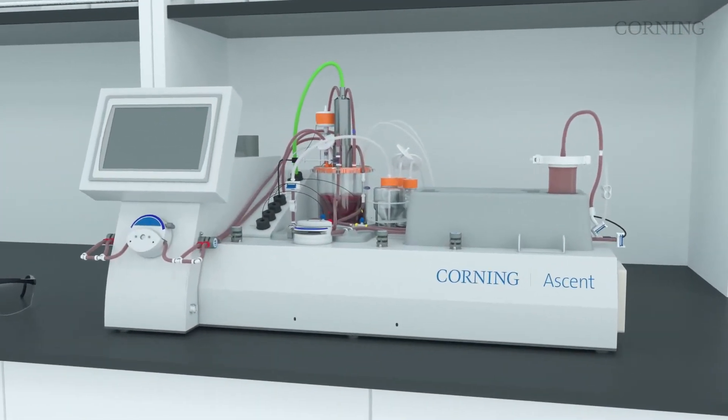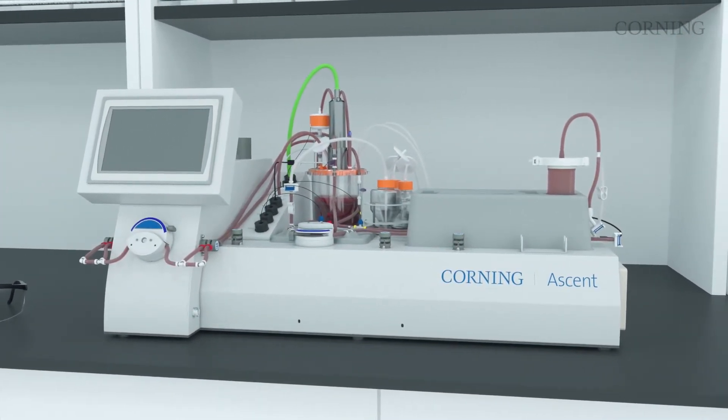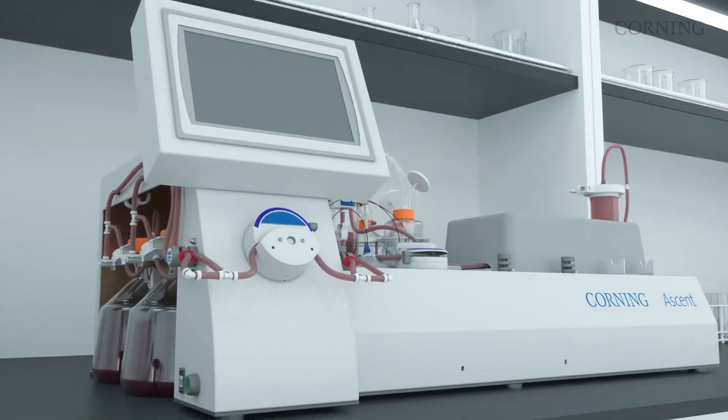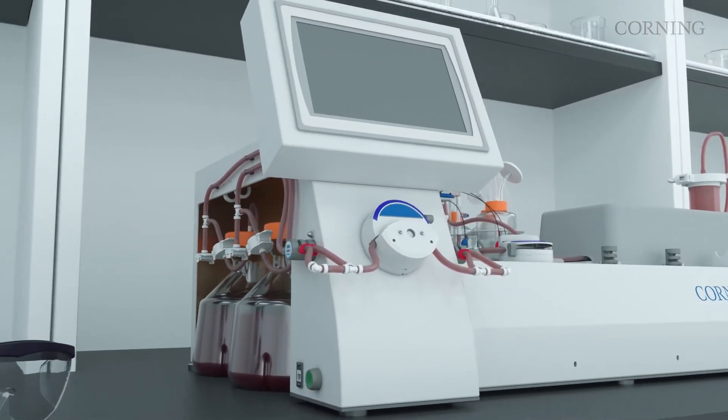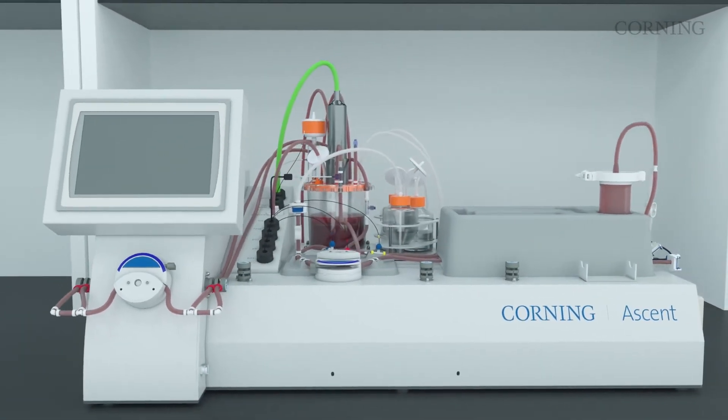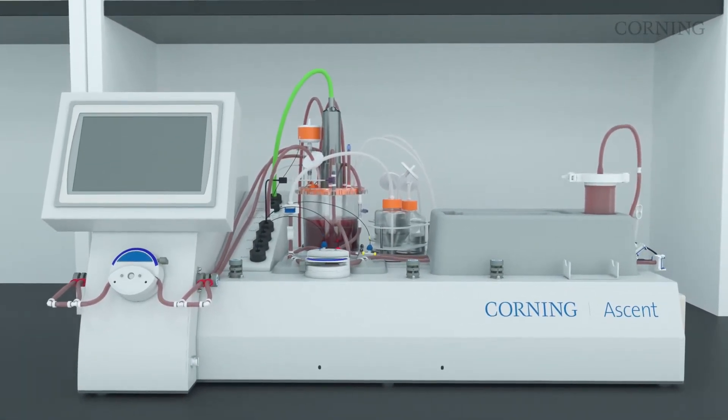To address that need, Corning developed the Ascent FBR fixed bed reactor technology. The Corning Ascent FBR system is specifically designed to provide the yield efficiency of adherent cell culture and the scalability of suspension processes.